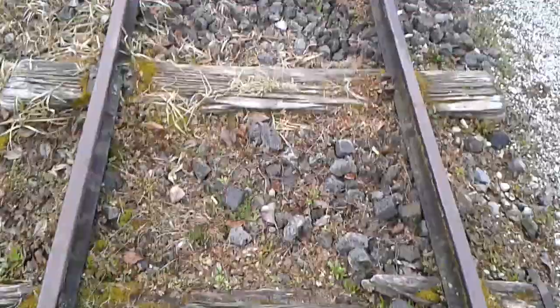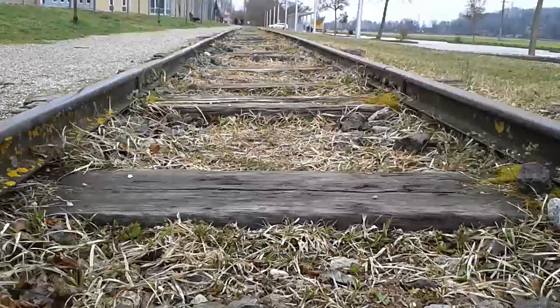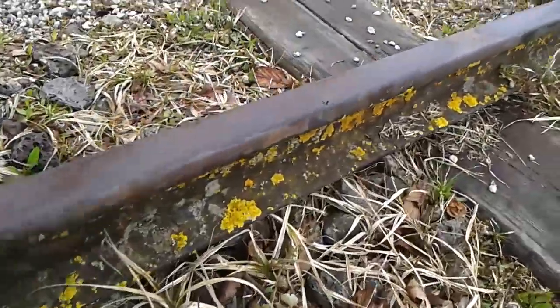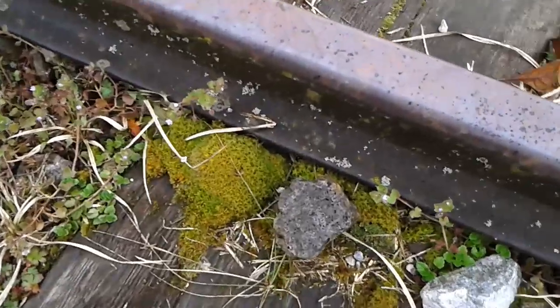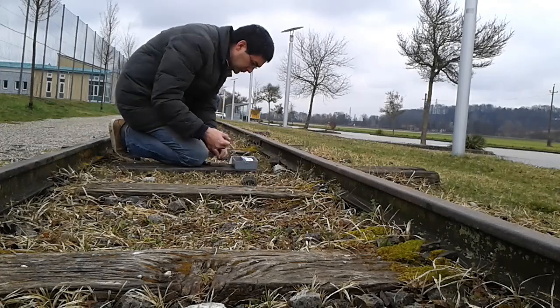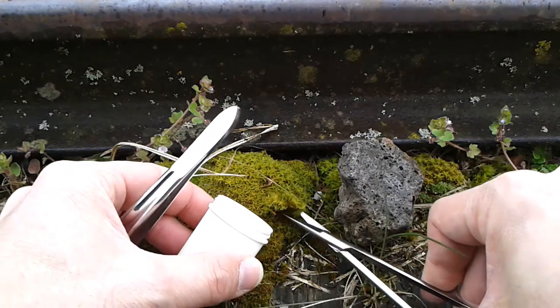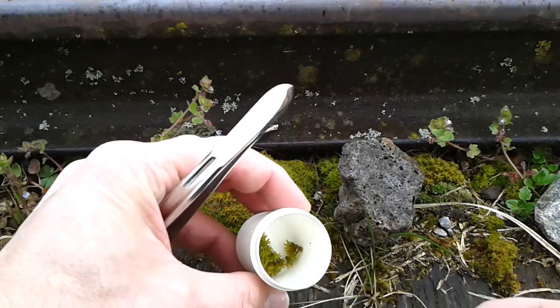In the village where I live there are some old railway tracks — they are not used anymore. Right on the tracks you can find some lichens, and over here some moss. I think I am going to take also a sample of this moss here. Maybe I can collect some samples over here with scissors. Okay, I think that will do for right now.